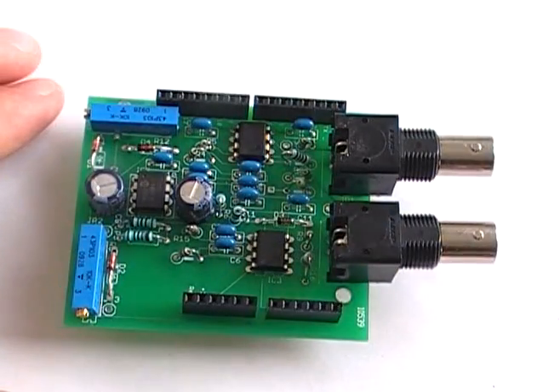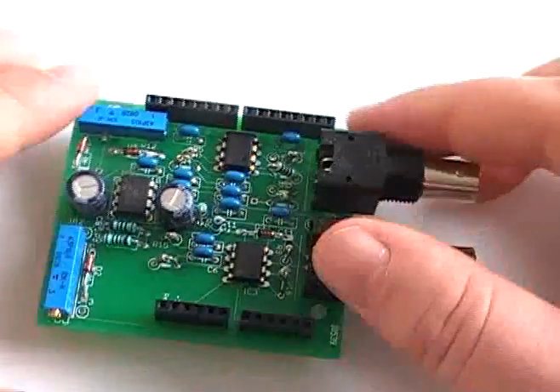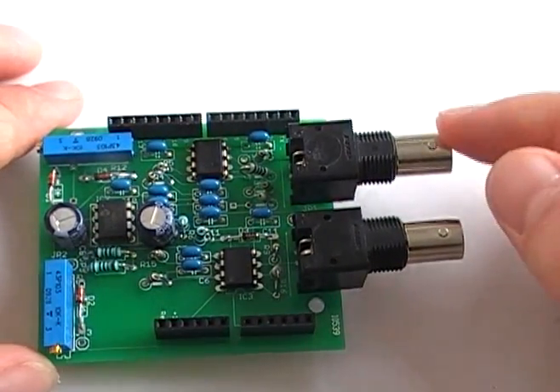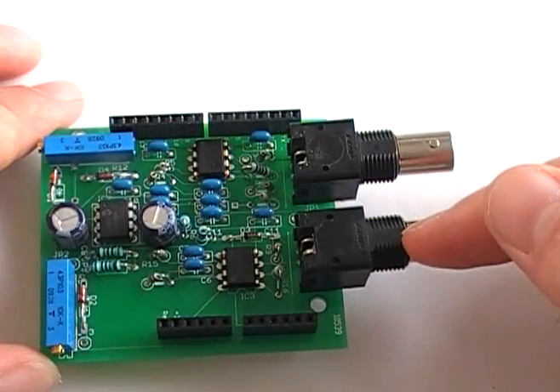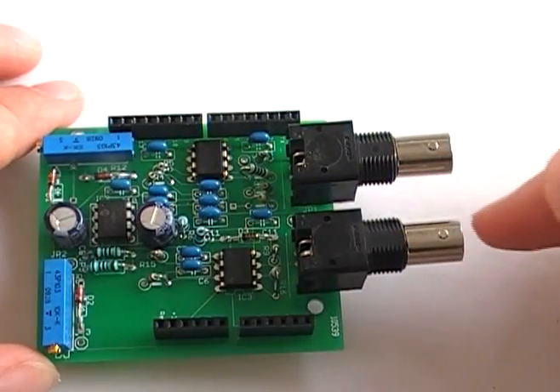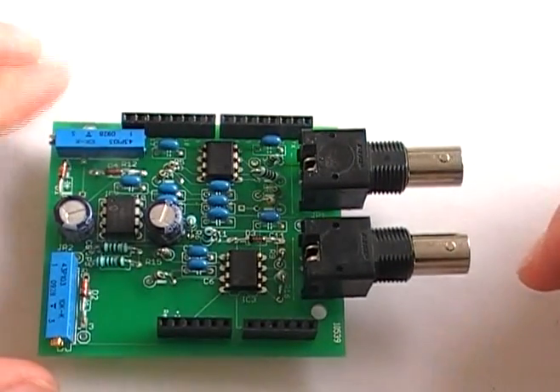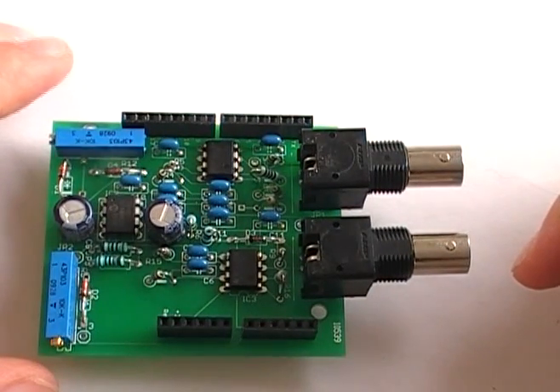That's the Forp Duino pH and ORP. Basically either one of the connectors can be used, but this one will be pH and this one will be ORP. I haven't done the ORP in the code yet, but it is coming. Lots of stuff to do first though.